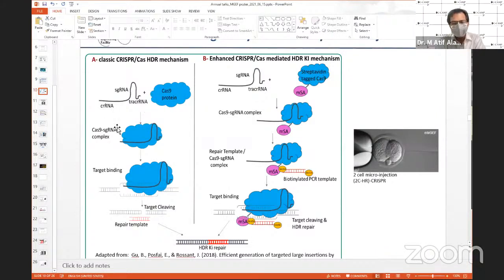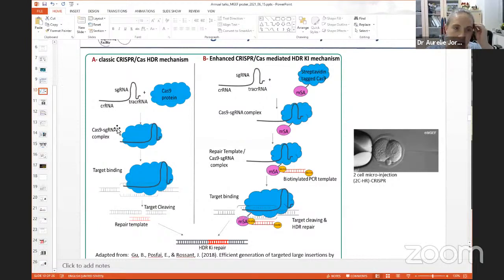I went a little bit fast, assuming that you guys knew how CRISPR works. Maybe Deepti will explain. But for CRISPR to work, you need the Cas9 protein, right? A guide RNA that's complementary to the region that you want to target, right? And so on the left panel is the normal scenario. What happens is the Cas9 protein actually makes a complex with the RNA via this little stem loop here. And then the RNA is going to drag the protein to the right target site and make the cleavage, right? So this is fine if you're doing a knockout or an indel.